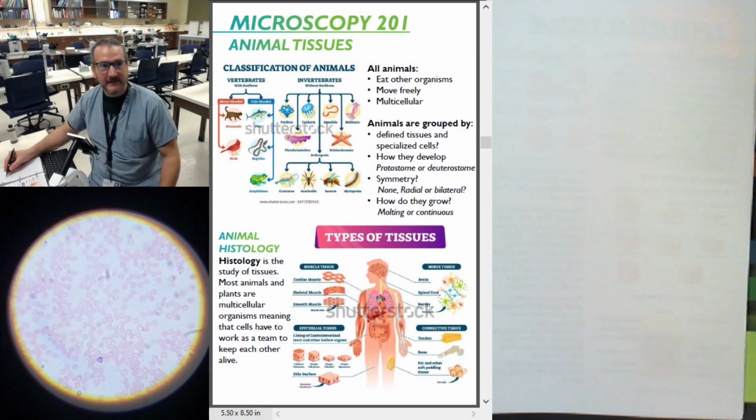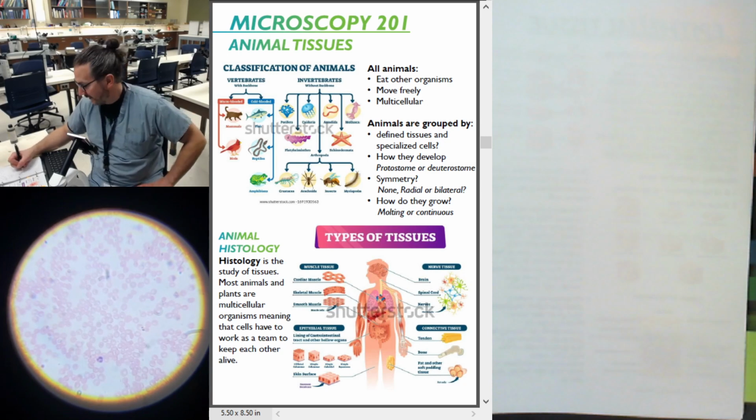So that is kind of kidney bean shaped. This one is kind of round. It actually looks almost like there's a lump there, almost kidney shaped until I look a little bit closer, kind of a lump here, and another one. Okay, these we call polymorphonucleocytes.